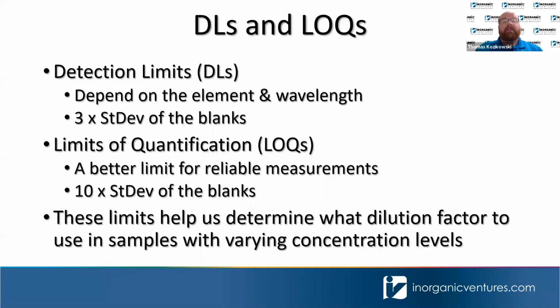But those limits are helping determine what dilution factor to use in our samples when we have varying concentration levels. Because my complicated blend example from before had a pretty big range, but I'll tell you what, with the customs that we make for some of the folks out there, it can be an even bigger range. So these limits make it so that we can do less preps in order to test these custom solutions without too much heartache.